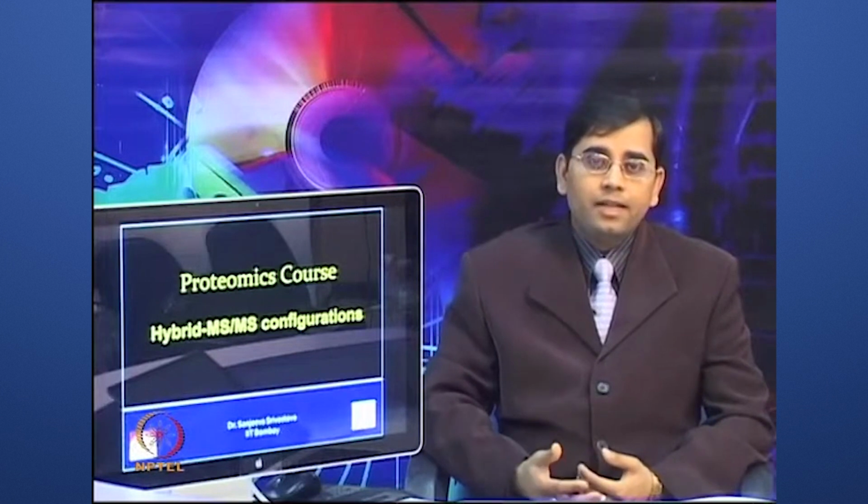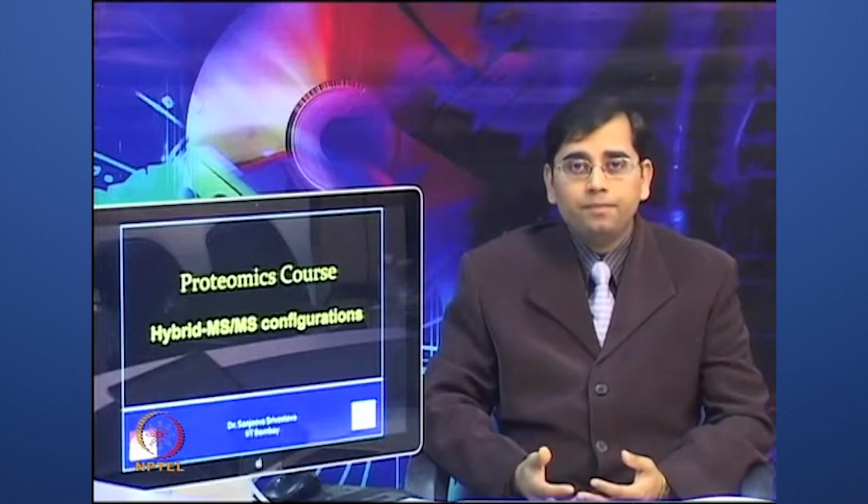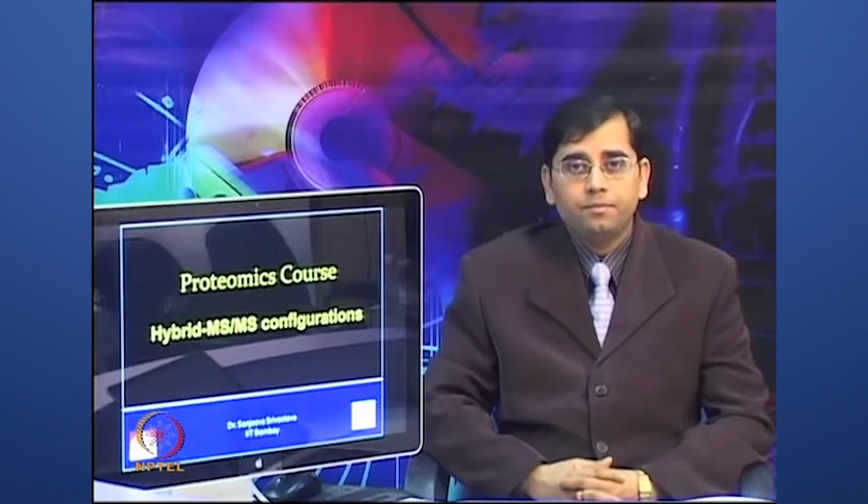So, we have discussed that different types of hybrid MS or tandem MS can be used for various proteomic applications.